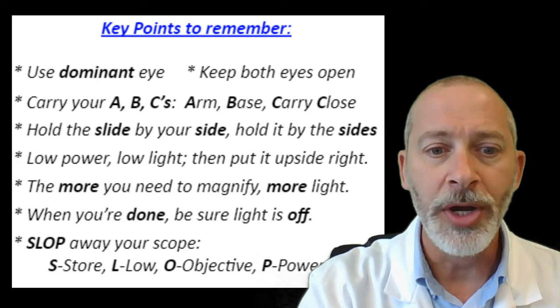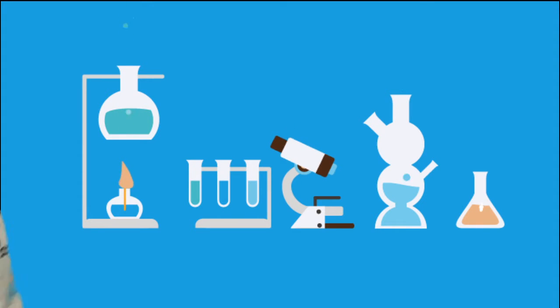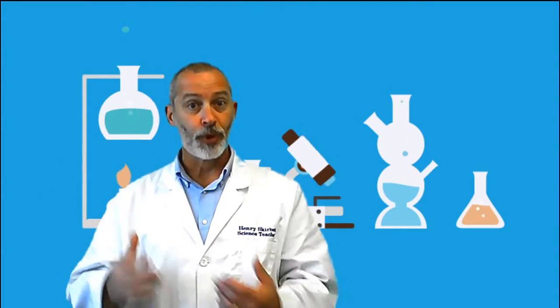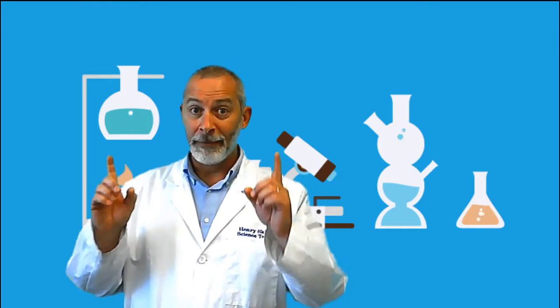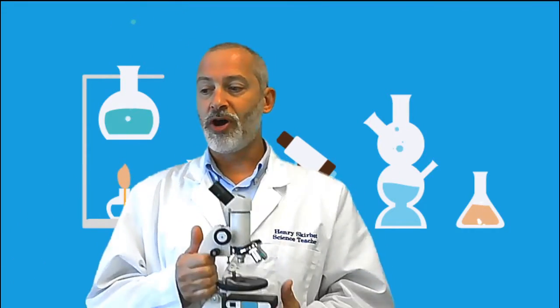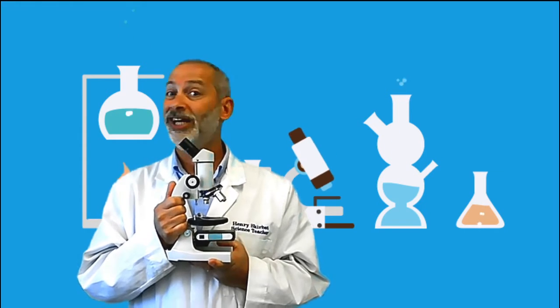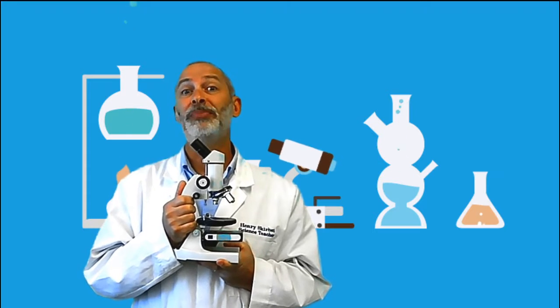All right, for this next one, we're going to go back over to the lab here, all right? I want you to remember the alphabet, your A, B, C's. Whenever you get a microscope or return a microscope in the laboratory, remember your A, B, C's. And what I mean by that is this. Microscopes are very expensive. They are very expensive and very fragile. You don't want to be breaking a microscope. They're several hundreds of dollars to replace.